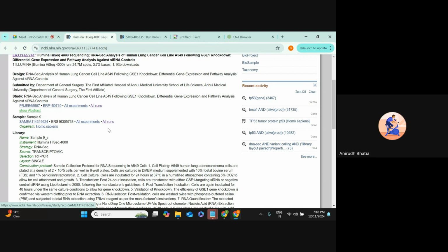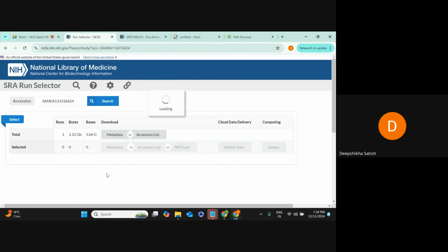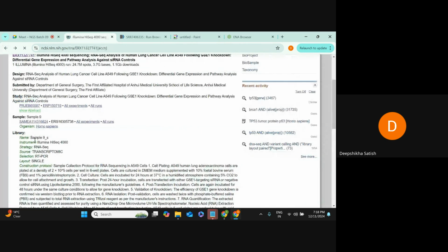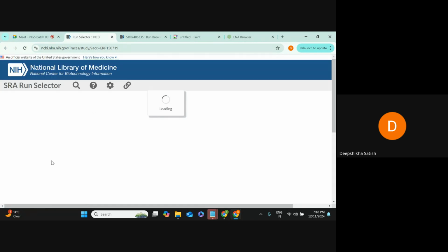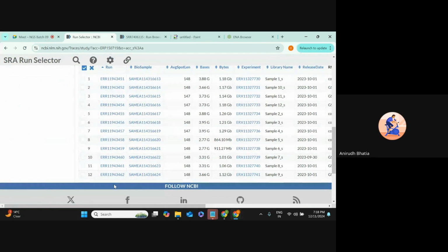Okay. So you can see here, if I have opened this all run from here, it is not showing any sample. Can you see below, right? So what I did, instead of using this, just select any one of these two. You will get the sample below. Can you see below now? Yes. So multiple samples. Okay, got it.